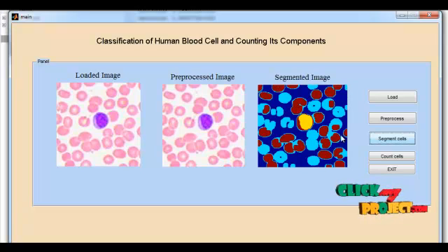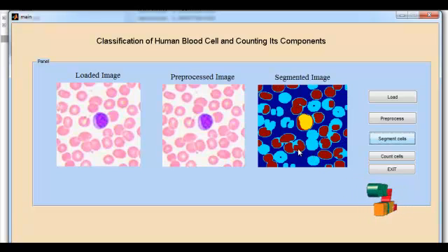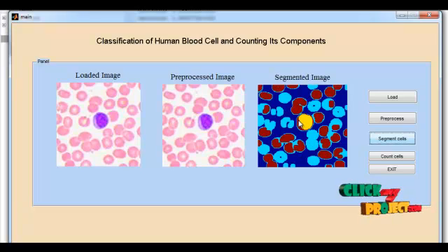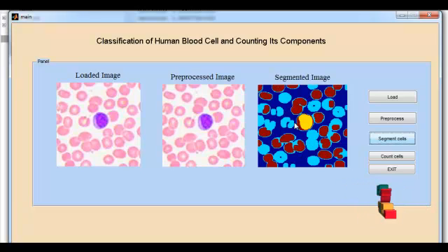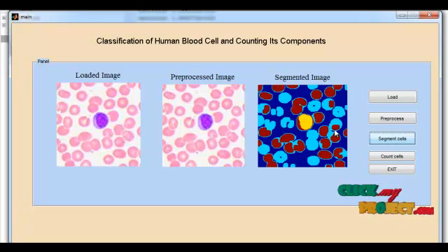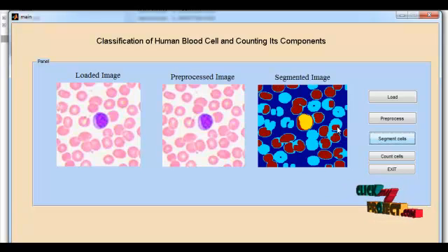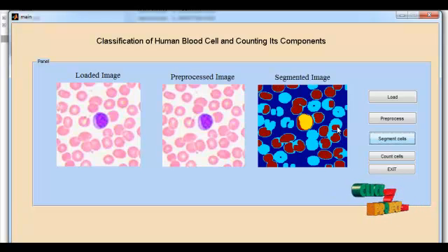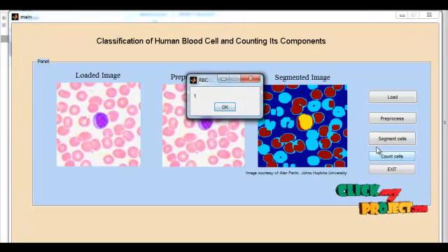Separate colors are applied to each segmented cluster. The platelet, WBC, and RBC are counted. Boundaries are set to protect the edges of the segmented regions, and the segmented boundaries are preserved. After that, we perform the labeling process, labeling each same-color cluster with labels one, two, and three for each color. Then we perform the counting.